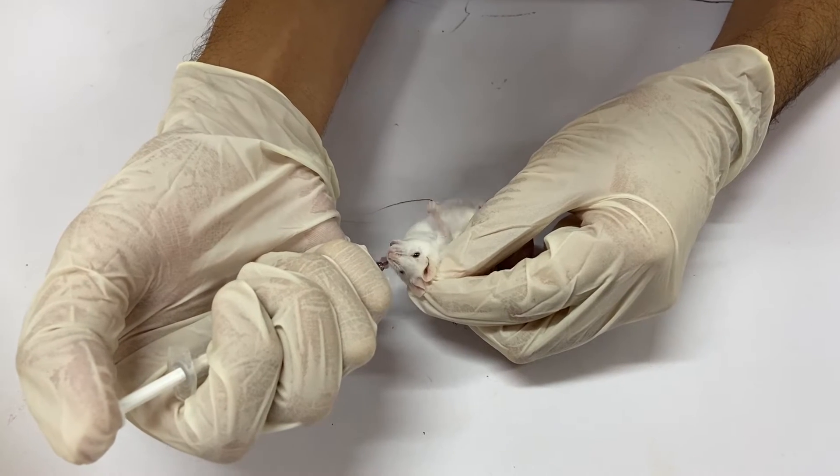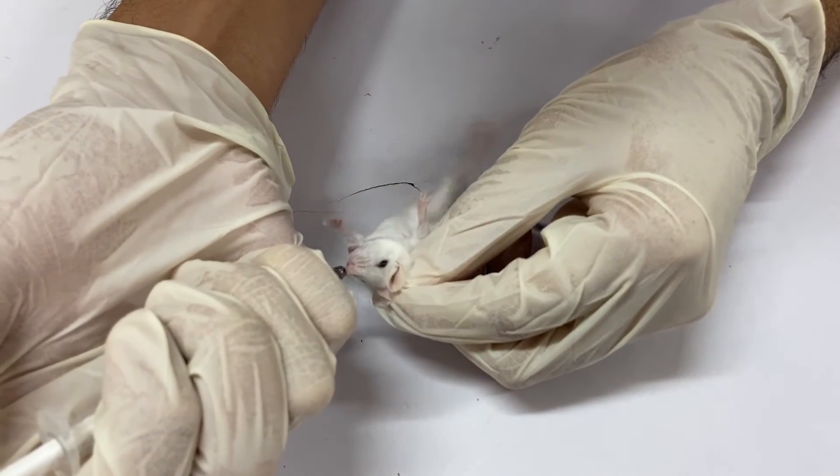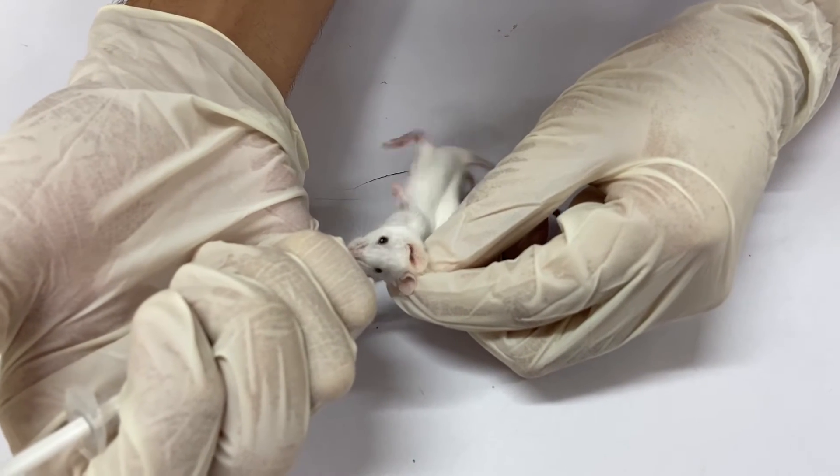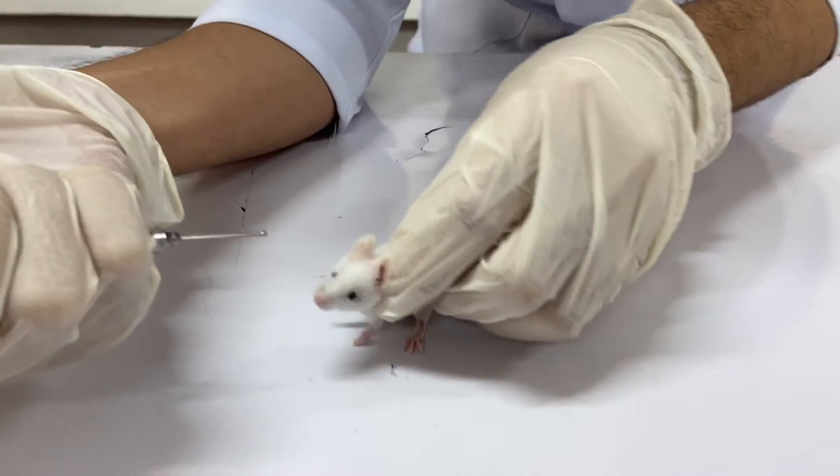Once the entire length of the gavage needle is inserted, inject the solution slowly and withdraw the gavage needle. Note: never aspirate the liquid.